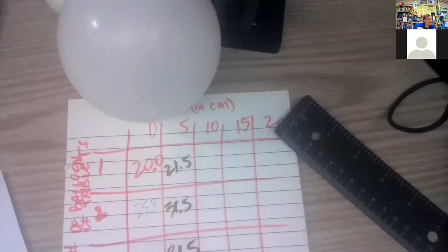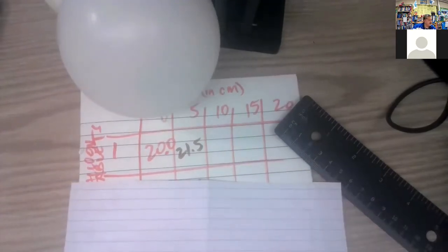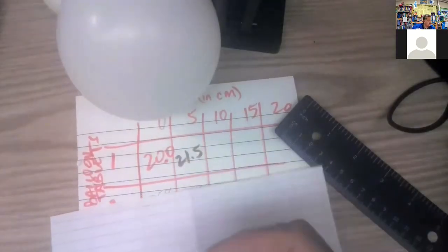Okay. I want to remind you though, with the mathematics of it, since we have a minute or so, what you're measuring right here, this is the circumference.